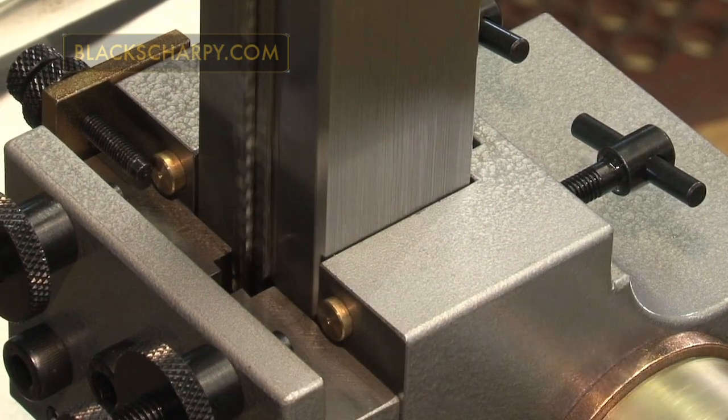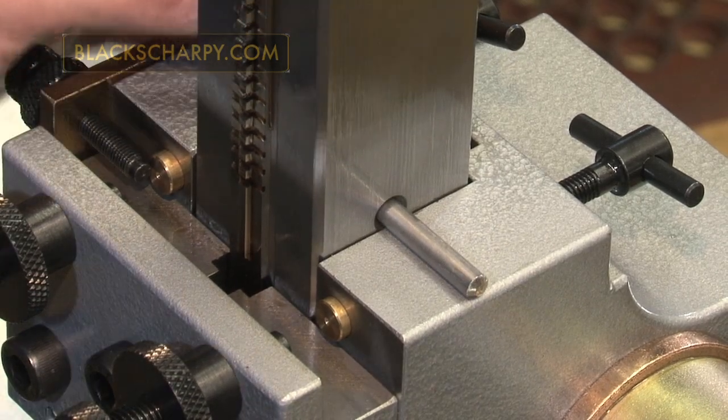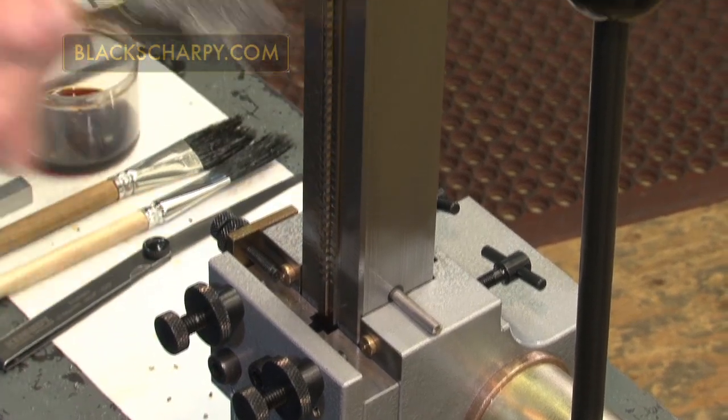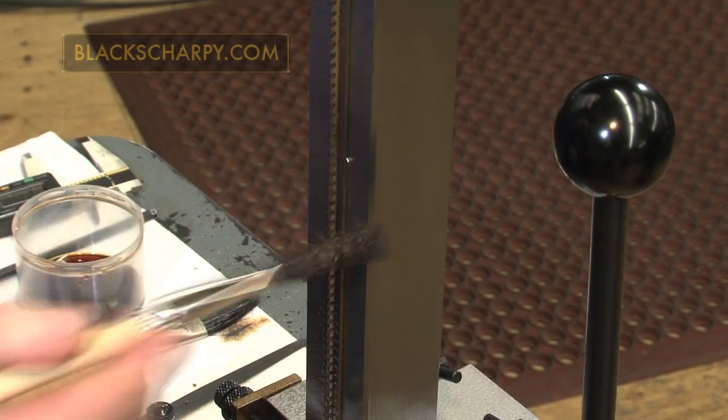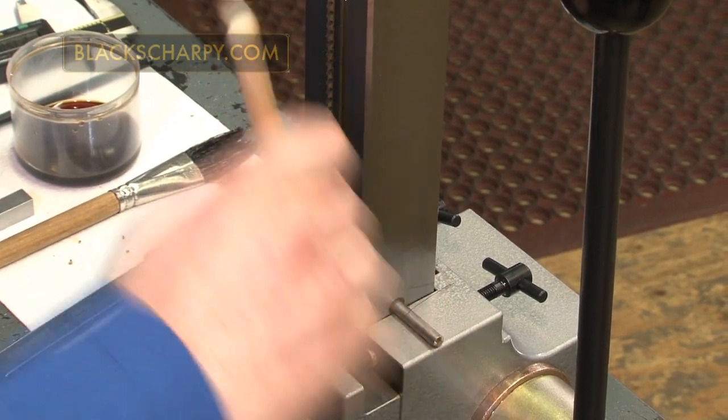Raise the broach and fit the support pin. Thoroughly clean the broach of the specimen cuttings using the wire brush supplied, and then clean the clamping area ready for the next specimen.